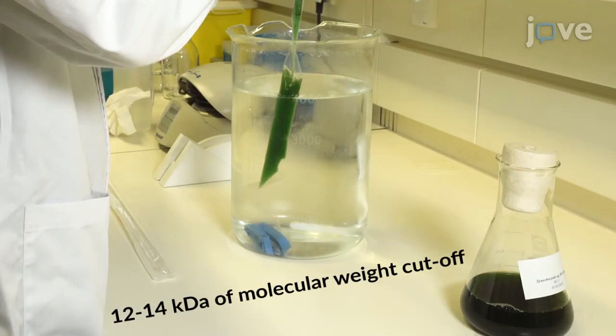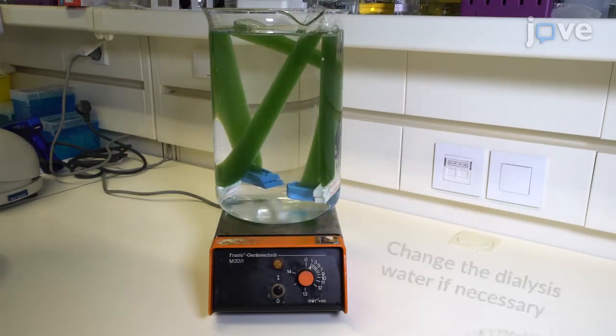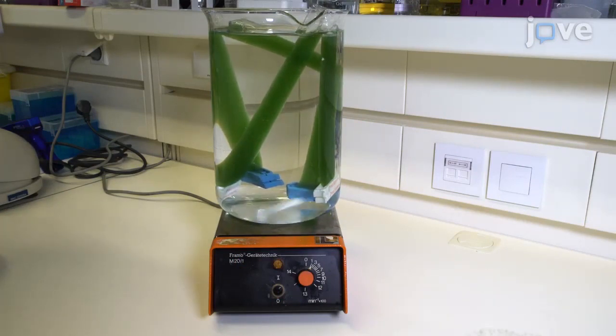Next, transfer the culture into dialysis membranes and dialyze against a minimum of 10 volumes of deionized water for 24 hours with continuous stirring.